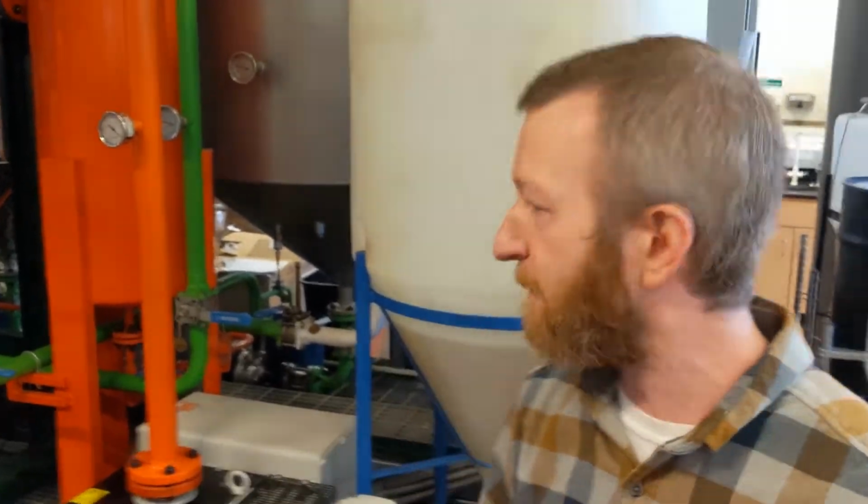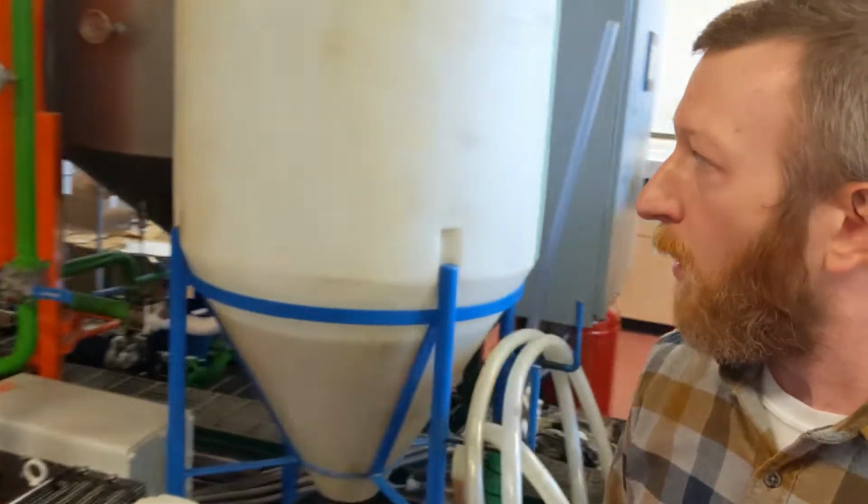It wants to sink down to the bottom. As it does that, it attracts contaminants, the things that are not oil, and it draws them down to the bottom of the tank for us. So we do this in a slow process, adding little bits of water, letting it sink down, drawing our contaminants out. That gets set aside in this tank, and it's a really efficient means for us to remove any final contaminants from the biodiesel. We set this aside, and we're going to try to use some of those contaminants getting pulled out of the biodiesel as well.